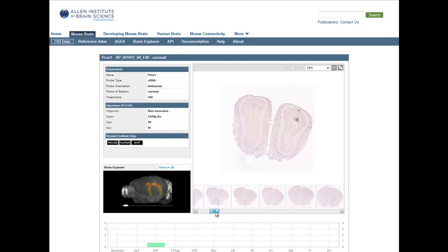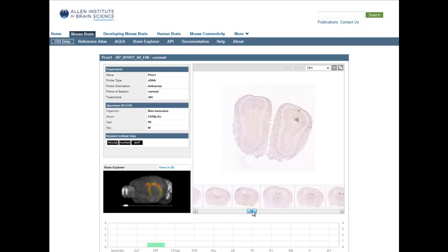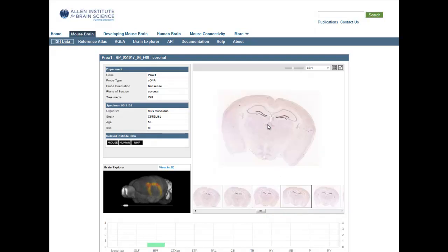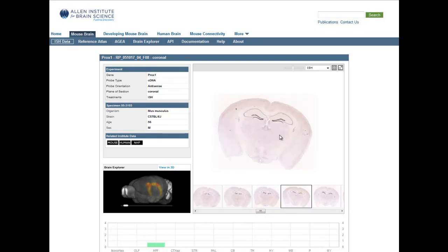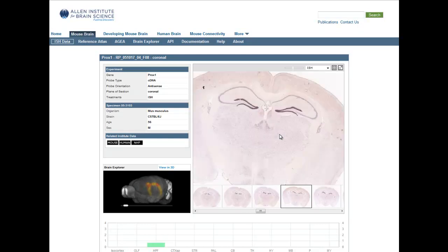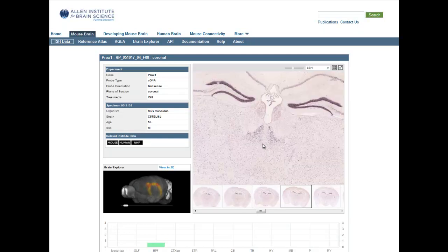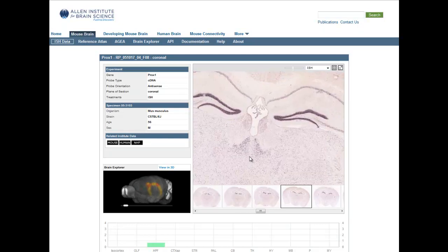The thumbnails at the bottom of the image viewer allow you to select a section to view, and the selected image in the main viewing area can be panned and zoomed in for greater detail. Zoom with the mouse wheel or with the A and Z keys.